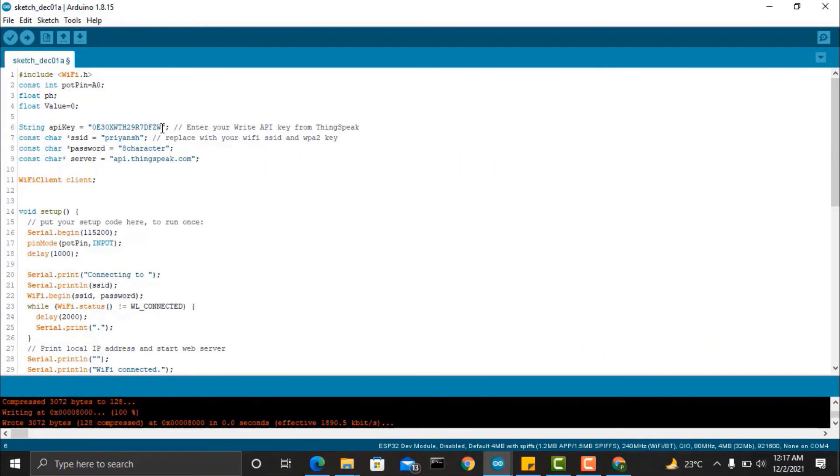Paste the API code in the Arduino code and update the Wi-Fi SSID and password.